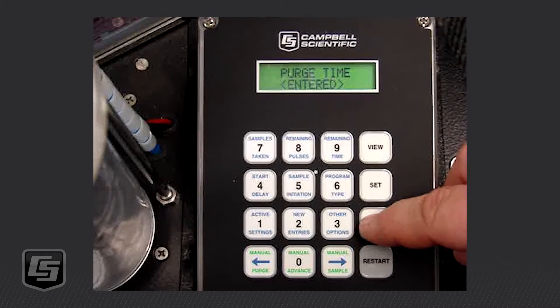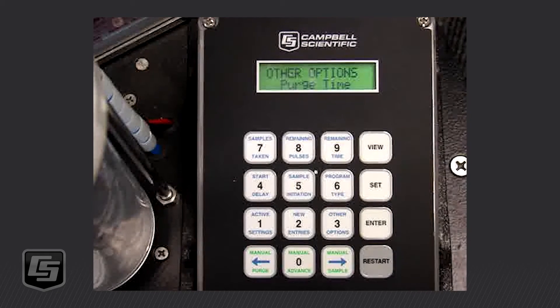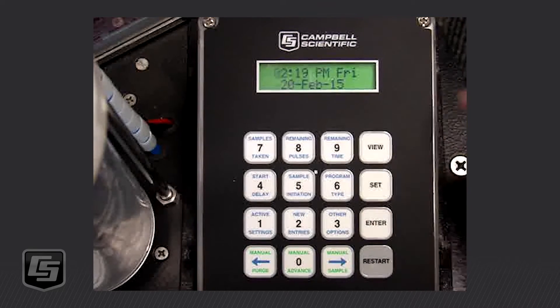That is entered now. I press Enter again and you'll see the purge time is now flashing. I'm going to use the left or right arrow key until I see the clock. You will see there are some other options available — Pinch Valve, which we want left normally open, Fault Shutdown, and the Clock. We come up to Clock and press Enter, and it's showing right now 2:19 PM, Friday, February 20th, 2015 — that's pretty close.